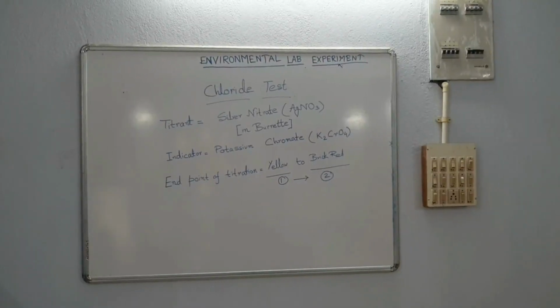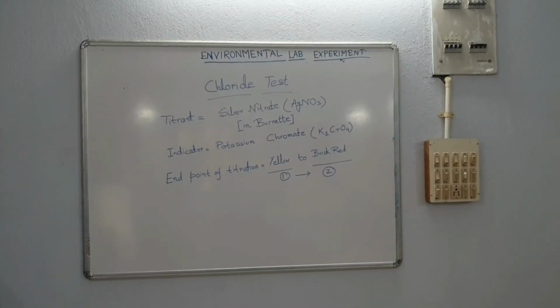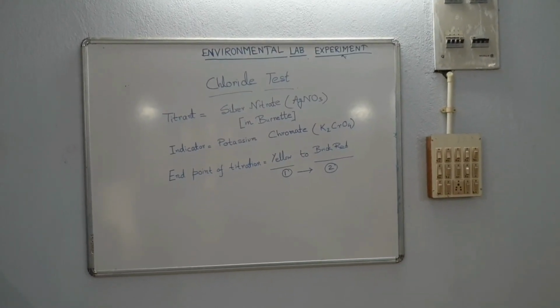Okay, dear students, good morning everyone. So today we will be performing the chloride test. So how do we perform the chloride test?